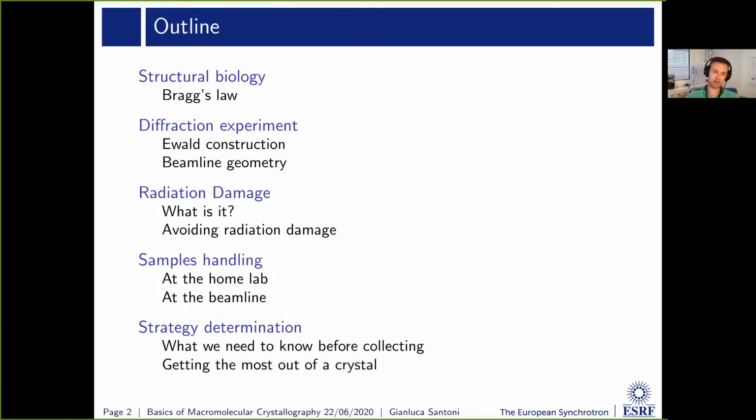So today the outline will be the following. We will start by quick definition of what to me is structural biology. And then I will introduce the Bragg's law, which is the main tool, the main definition for crystallographers. We'll then go and analyze what's the theory behind the diffraction experiment and how the diffraction experiment can be translated from the theory to the Beamline setup. Then this is based mostly on the geometry of the experiment and on the idea that it will be possible to collect forever from the crystal.